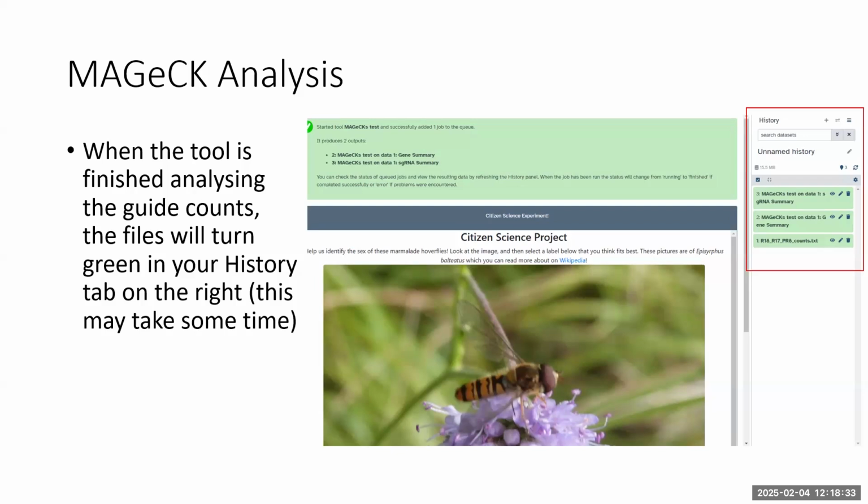Yeah, I think for the most part, the guide libraries are going to become more and more available, where you can just select a species and go, genome-wide library. And I would imagine, I don't know if there's a tool yet where you can select a function, for example interferon or something like that, and it'll just produce a library for whatever species you want. I can't imagine they're that far off. It wouldn't be that difficult to do. Yeah, because that is a bit of a bottleneck at the moment. You have to have someone who can do that if it's not available.